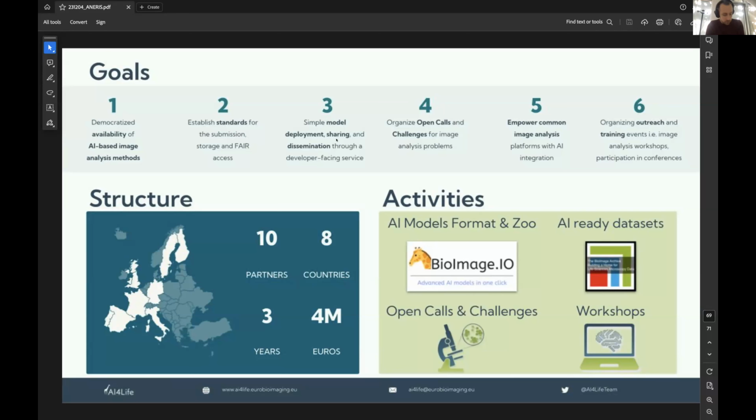And one of the things that we are currently working on is a big documentation effort for the next package. So I mentioned this package we're working on. We're also doing there a lot of experiments and a lot of description of in which situation you would want to change which parameter. So this is something that is, I agree, important and usually not always done super well.